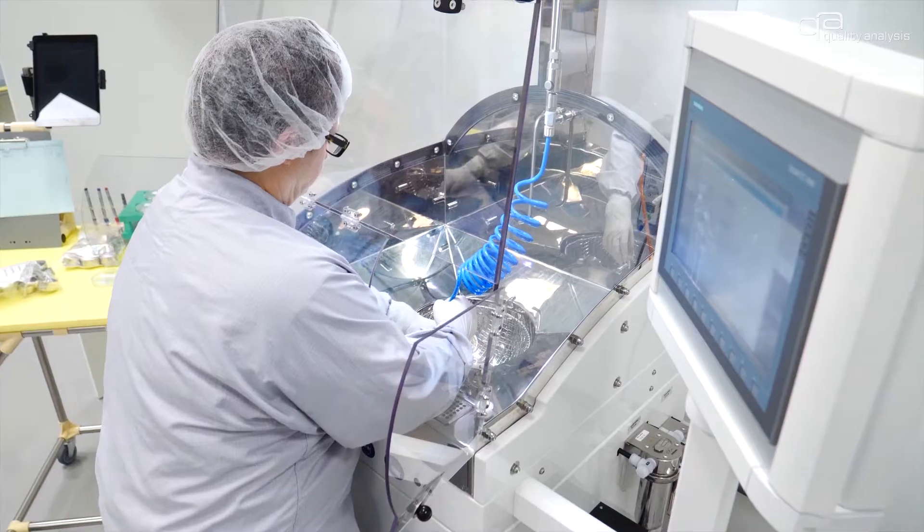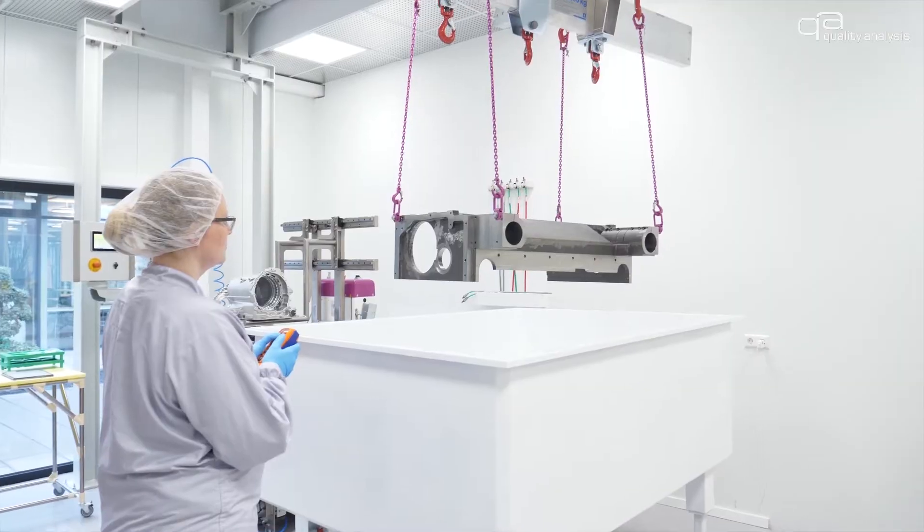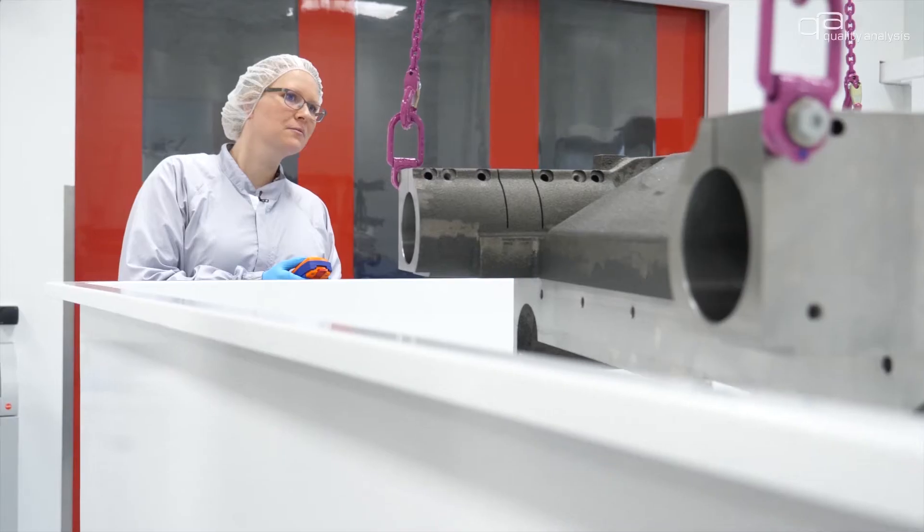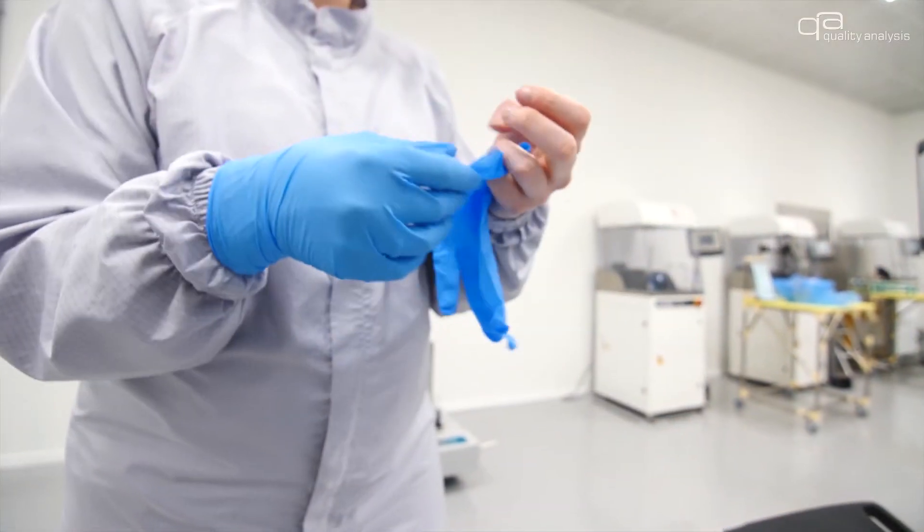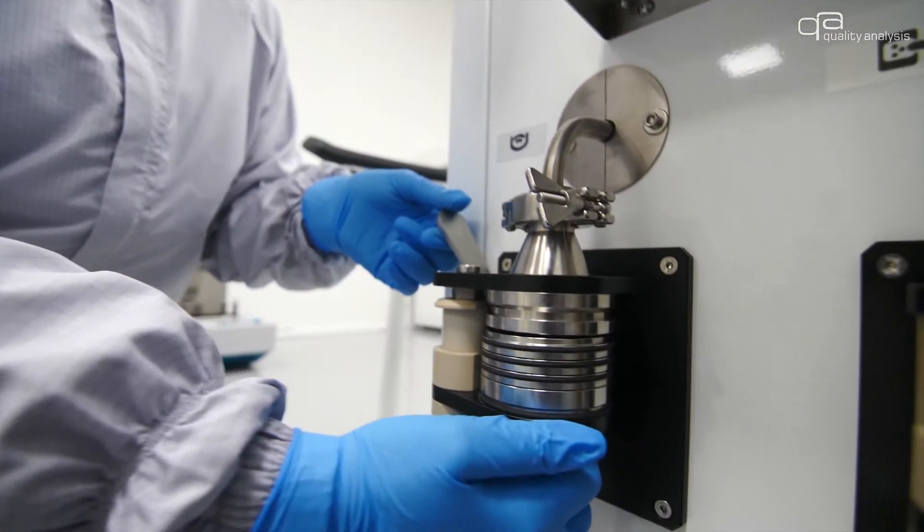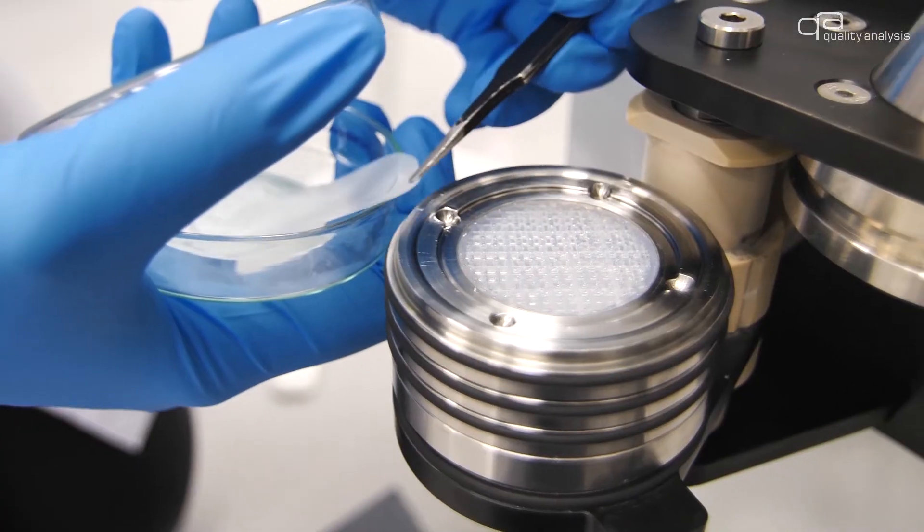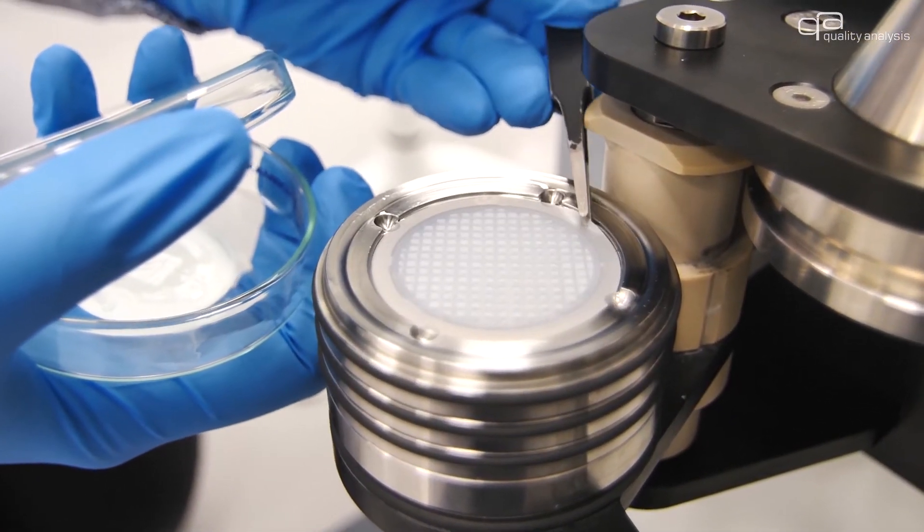For the extraction of particulate contamination we have various cabinets for different component sizes and geometries. All used filters are conditioned by our staff before extraction as well as afterwards in order to create reproducible conditions.